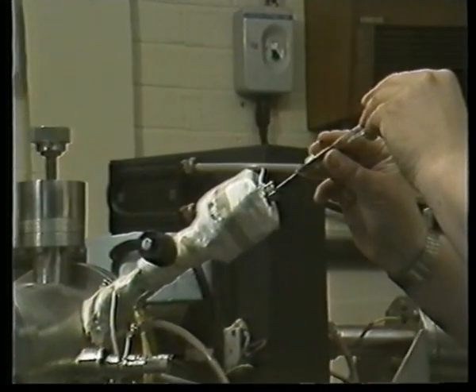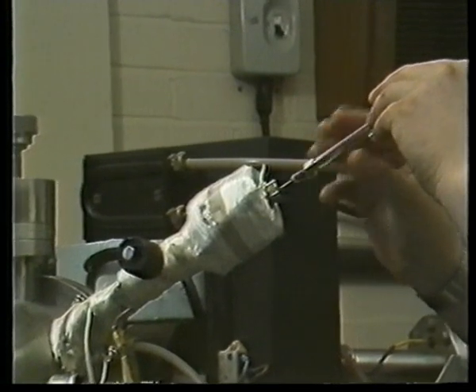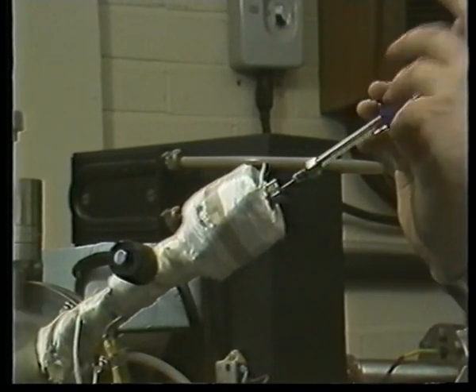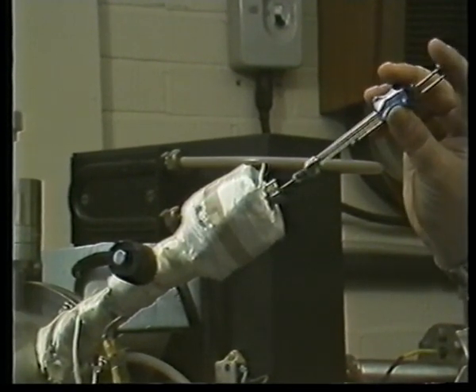The syringe is being used to introduce a sample which needs to be analyzed. This particular sample is an organic liquid.